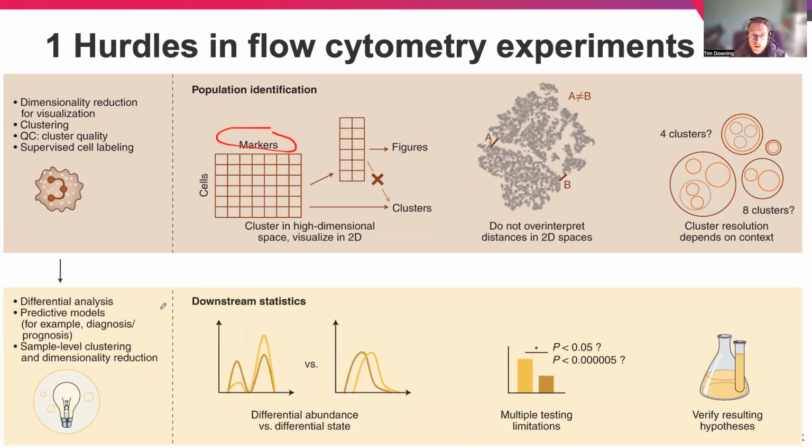And then we have downstream analysis of whatever application. So we're looking at particular clusters of samples, particular features of certain dimensions, testing for changes in levels of different features as well.